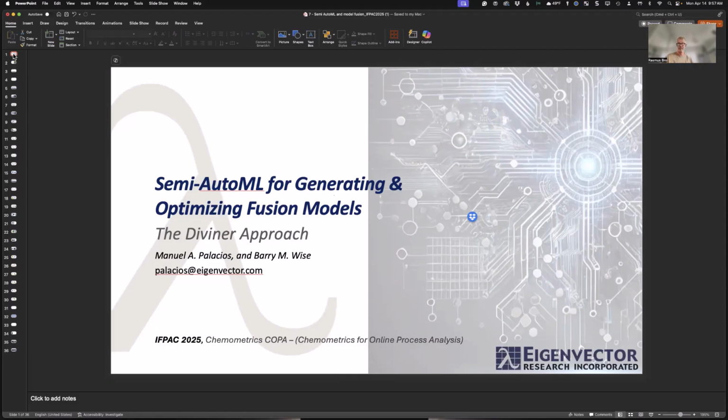So if you don't like a deep learning model, well, fair enough, you are not going to like an ensemble model. But if you're allowing a TensorFlow model in your environment, then you shouldn't have a problem with ensemble models. And if, for instance, you're using an XGBoost model, it would be sort of the same. So it all depends on your level of comfort there.